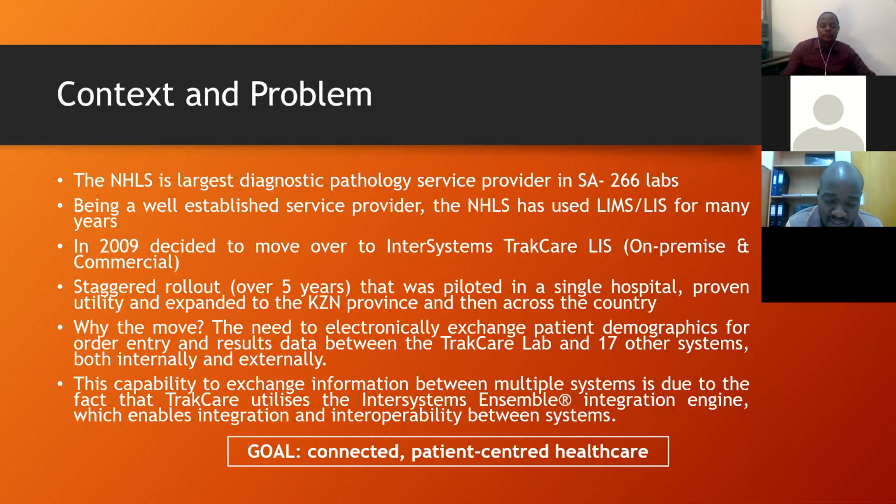When we did the implementation, we started with a pilot in a single hospital. So there was one laboratory at a hospital where we piloted the application. And then when the application was evaluated and signed off, we expanded to the rest of the province where we started. We've got 10 provinces in the country. It took us 5 years to roll out to all the 266 laboratories across the country. So you can imagine how big this implementation was.